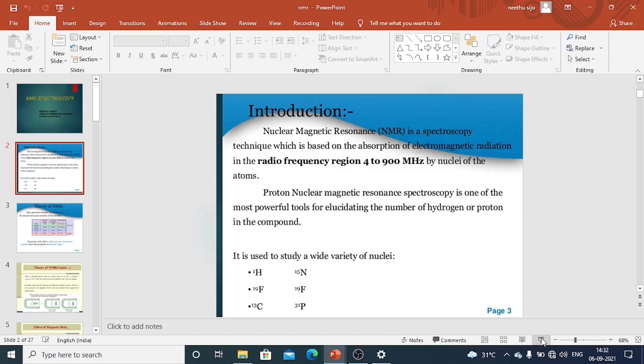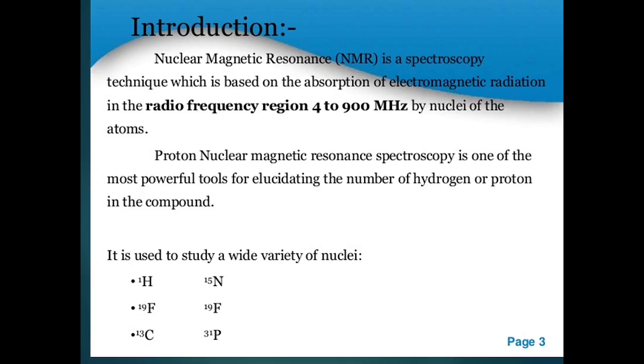Nuclear magnetic resonance spectroscopy is a nuclei-specific spectroscopy. NMR uses a large magnet to probe the intrinsic spin properties of atomic nuclei. Like all spectroscopies, NMR uses a component of electromagnetic radiation, that is radio waves, to promote transitions between nuclear energy levels.